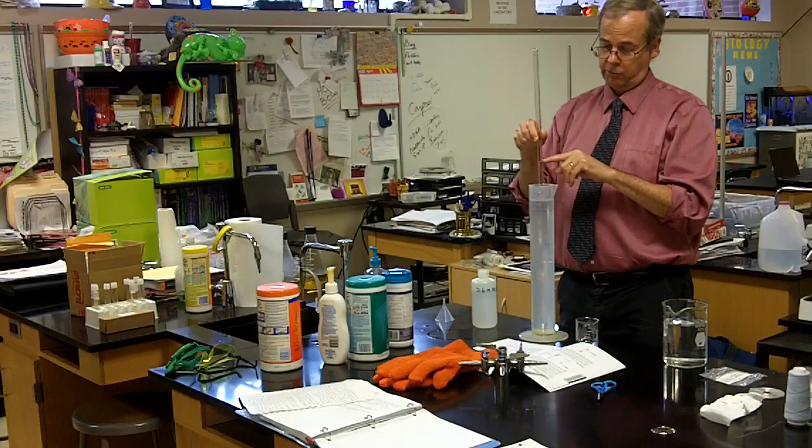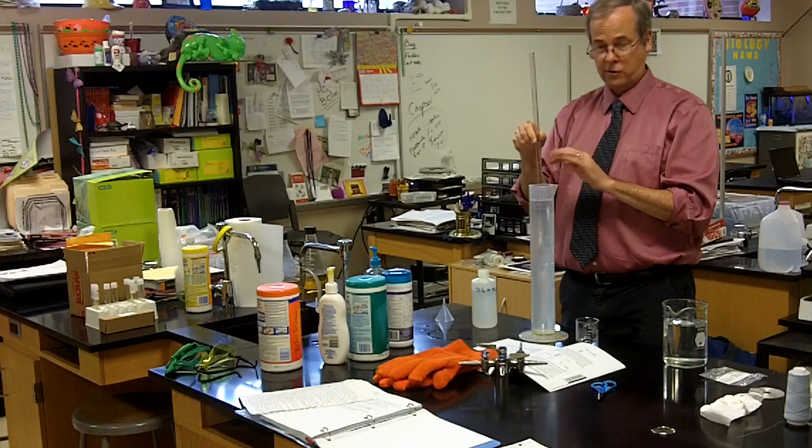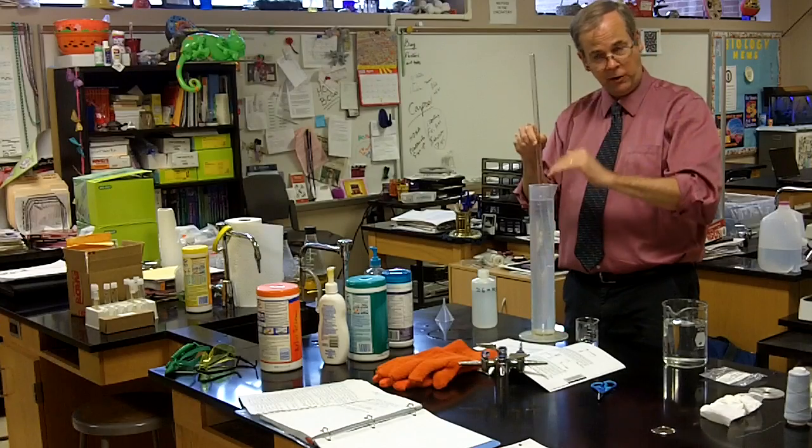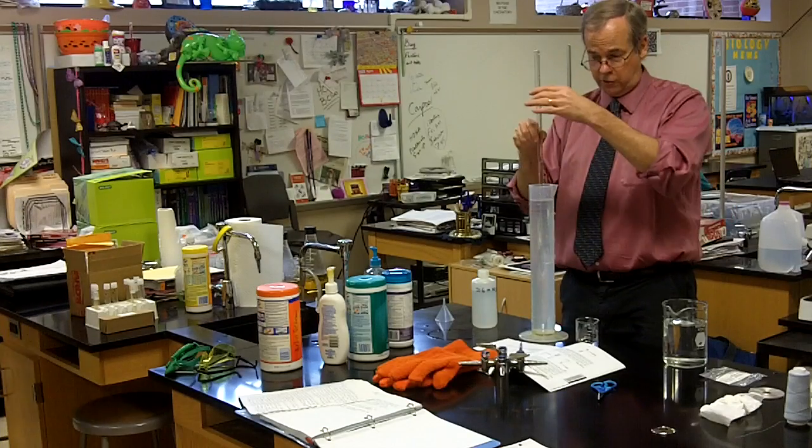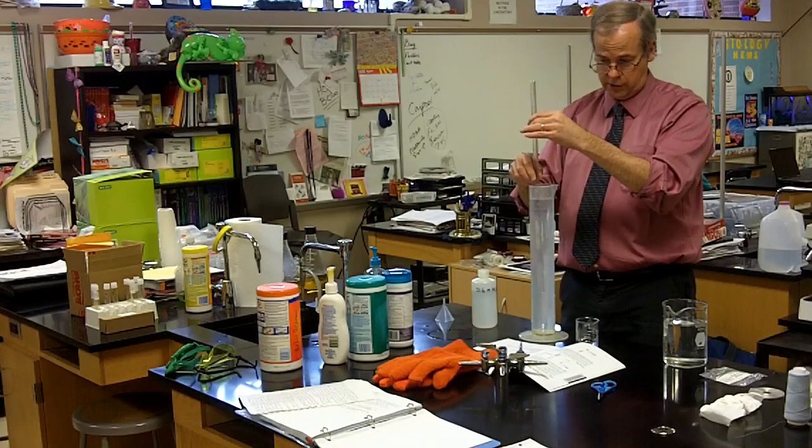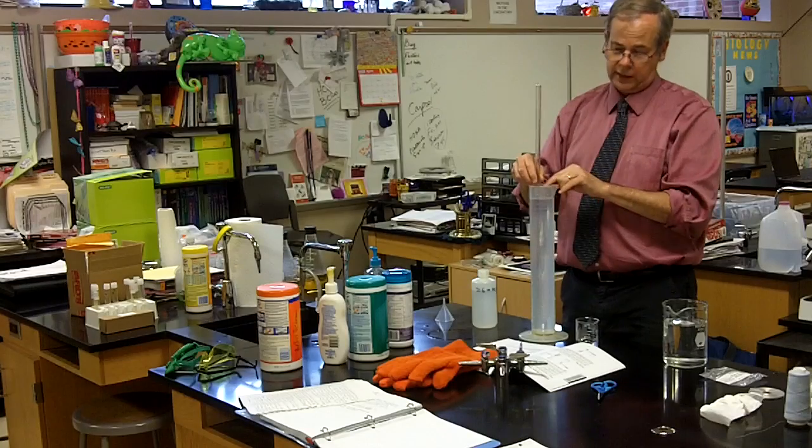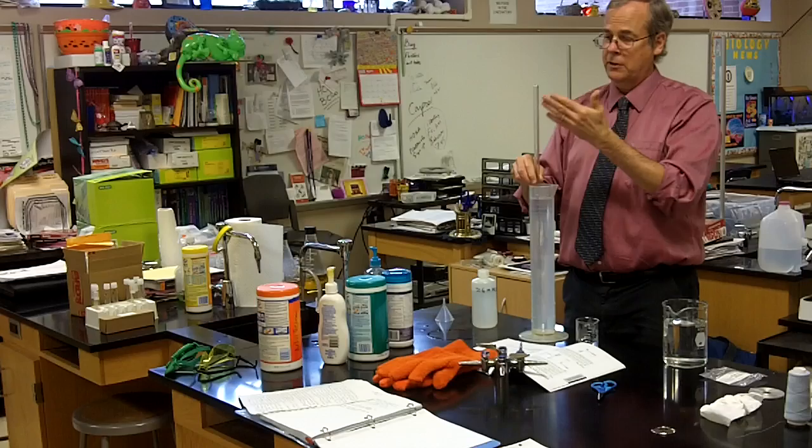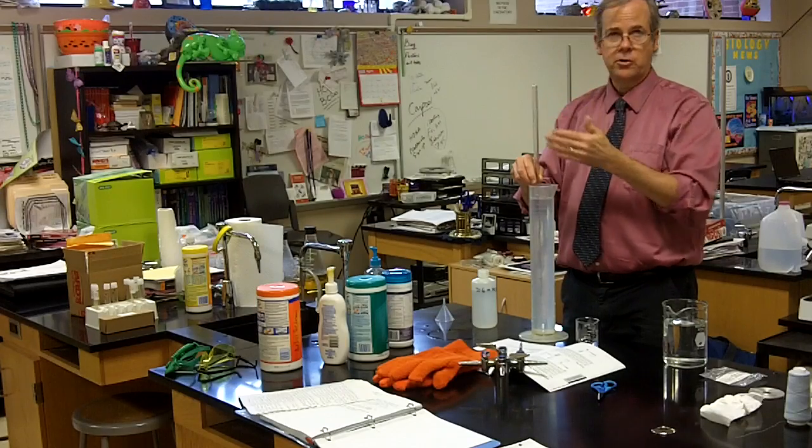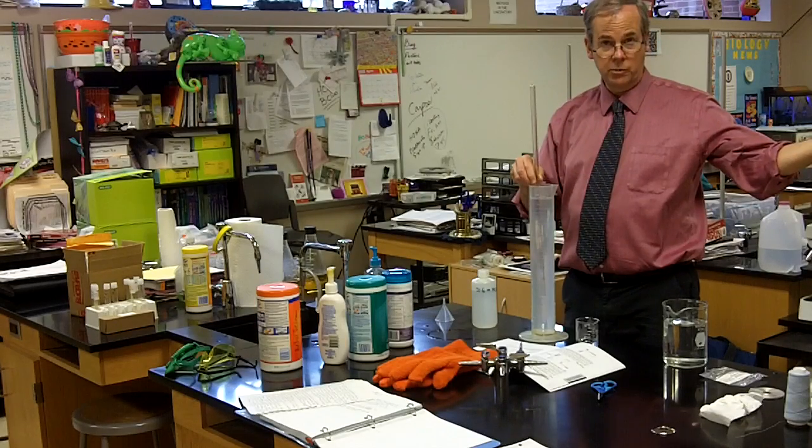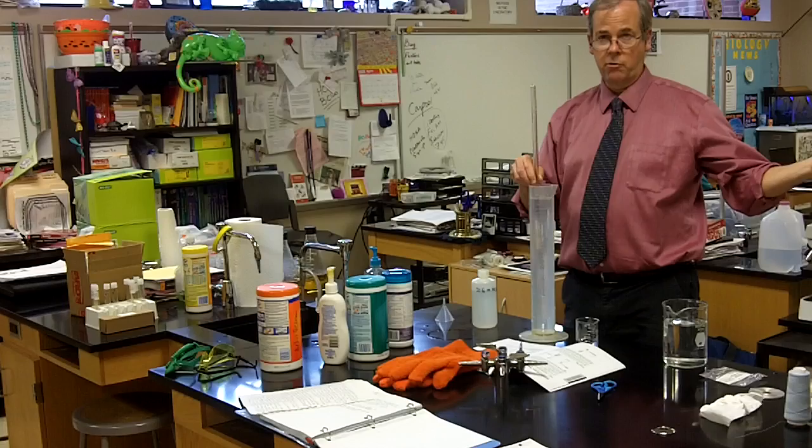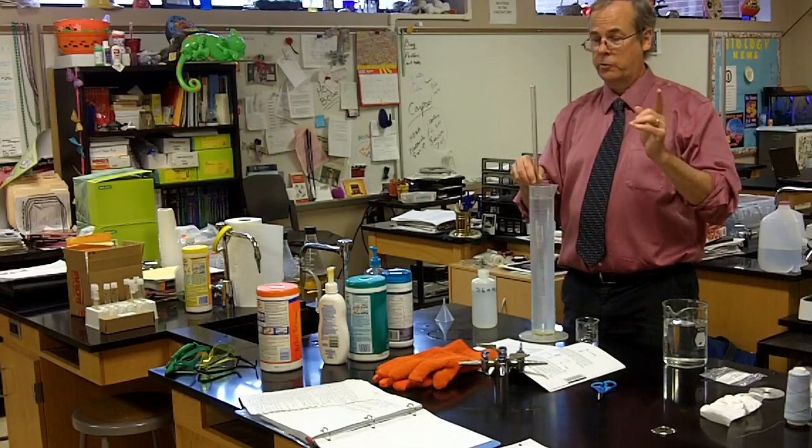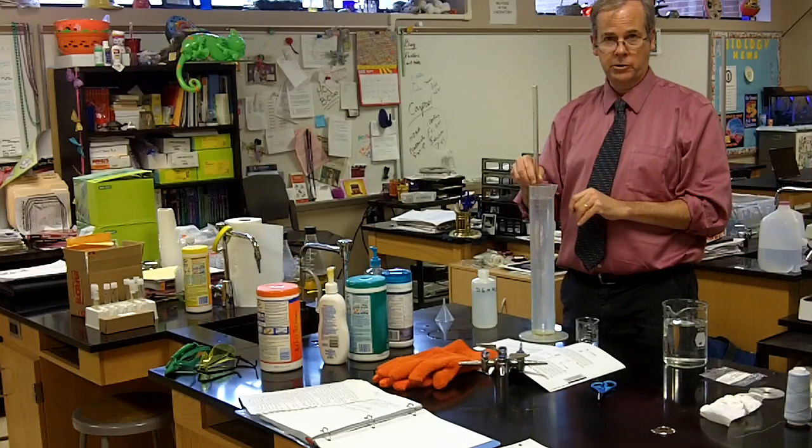So what I do is I lower the tube so that the level of water inside and outside is identical. And that means the pressure of the gas in this tube is the same as the pressure in the room. All we need to do is check a barometer, and not only do we know the pressure in the room, we now know the pressure inside the tube.